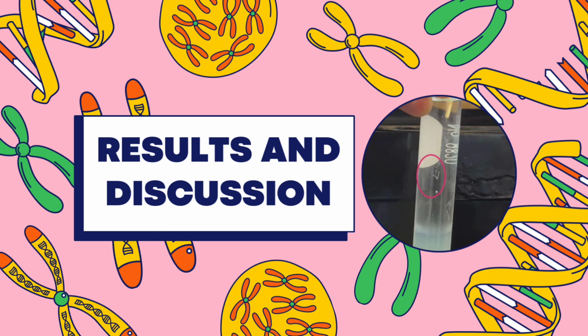So the expected results for this experiment: in the DNA extraction experiment, we anticipated that the addition of cold ethanol to the banana extract would yield thick, visible strands of DNA that could be easily spooled onto a stick or pipette. We expected the DNA to appear as distinct, robust fibers, indicating a successful extraction process. This expectation was based on previous studies and protocols that typically result in clear, well-defined DNA precipitates when using effective lysis buffers and proper precipitation techniques.